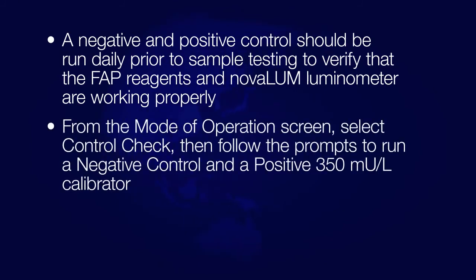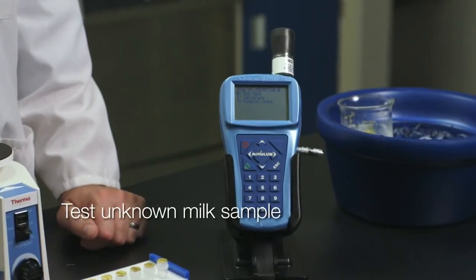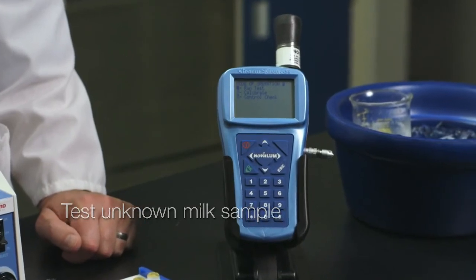From the mode of operation screen, select Control Check, then follow the prompts to run a negative control and a positive 350 milliunit per liter calibrator. Please refer to your operator manual for more information. Now we'll demonstrate the steps needed to test an unknown milk sample.